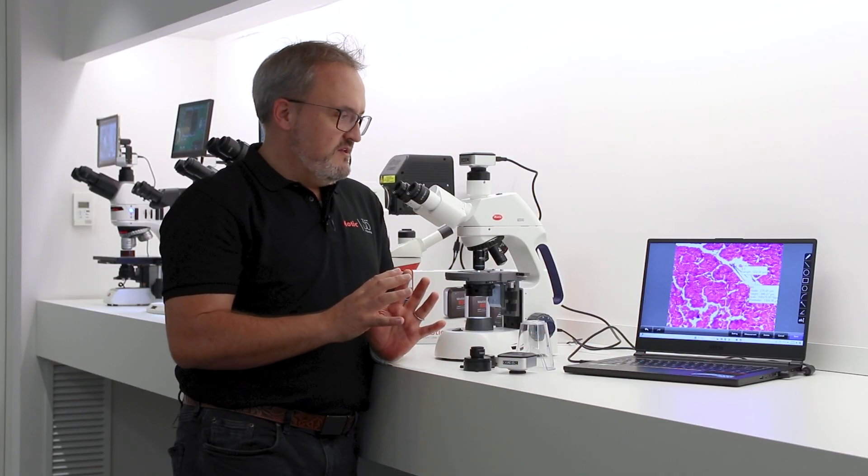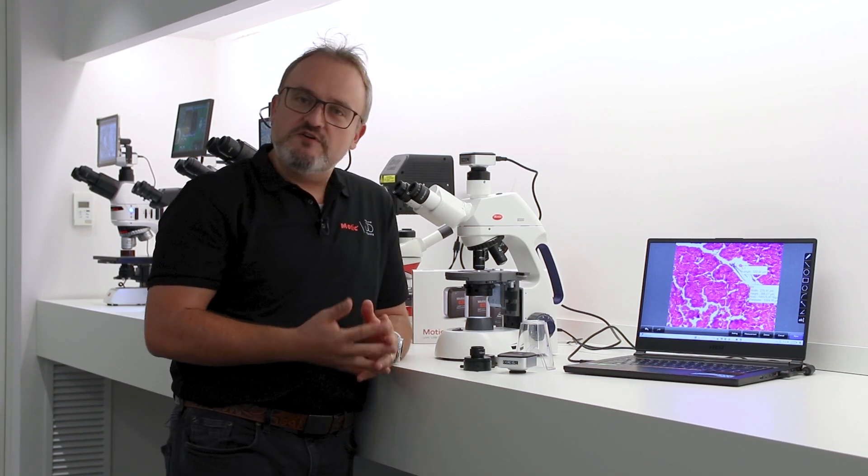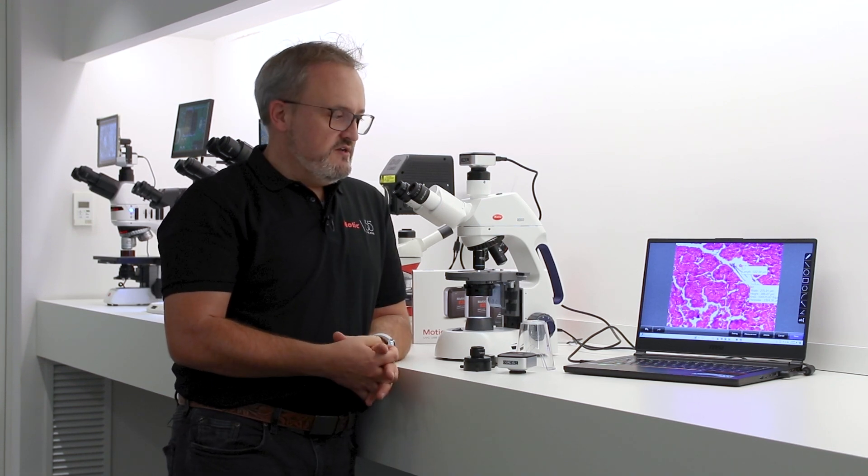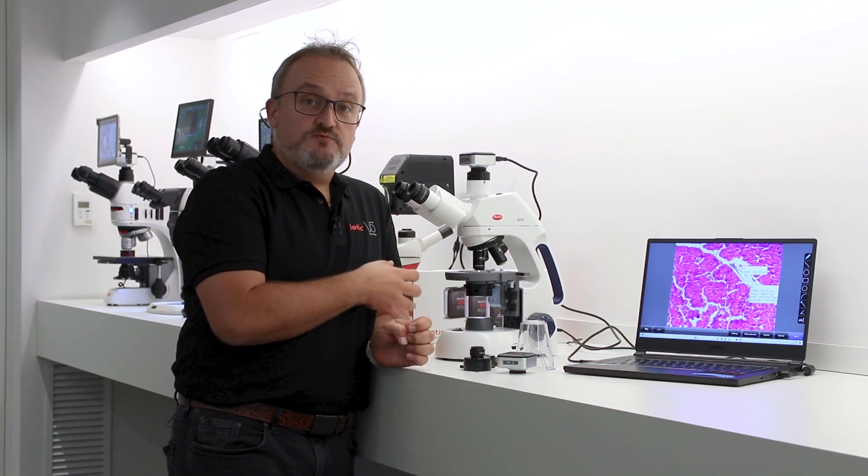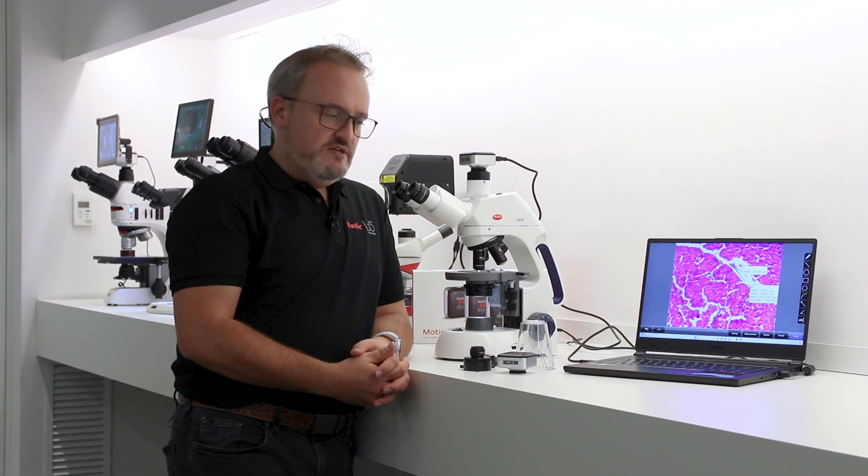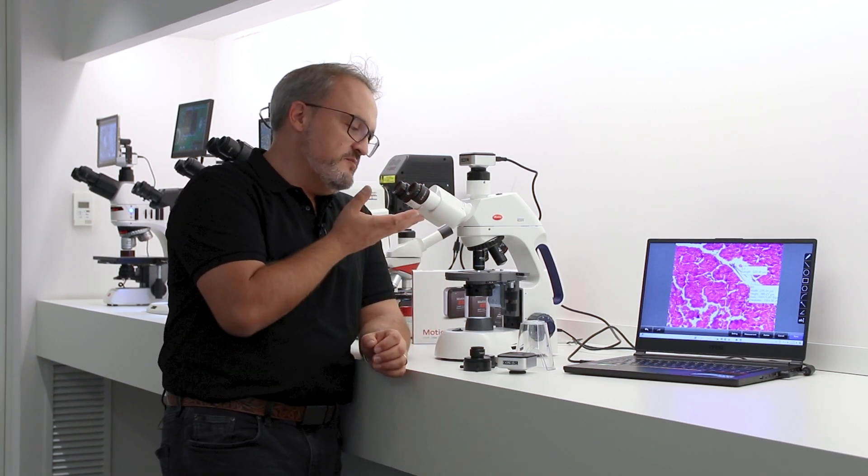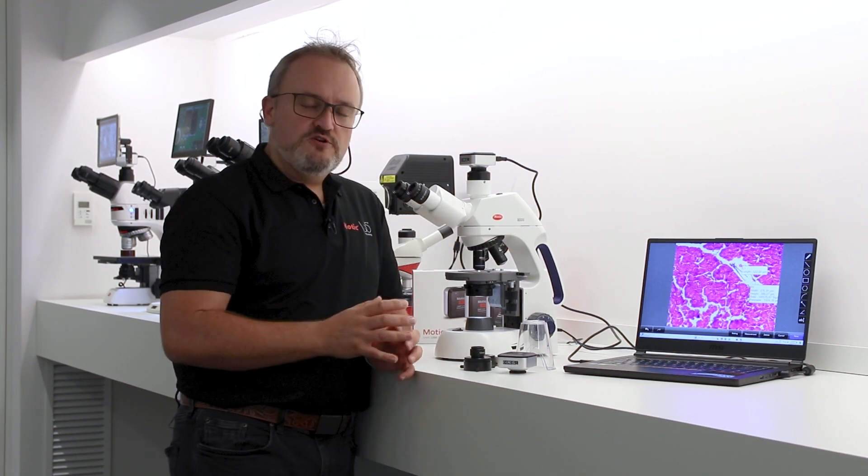This is very popular with veterinarians, in universities, and also in secondary schools because now you're making science more interesting. It's not just about looking at what the teacher is telling you to look at, but you're also now easily measuring and learning from the image. If you're not so familiar with using a microscope or being able to concentrate using a binocular or even a monocular, by having it on the screen you make the microscope and the microscope image far more accessible to others.